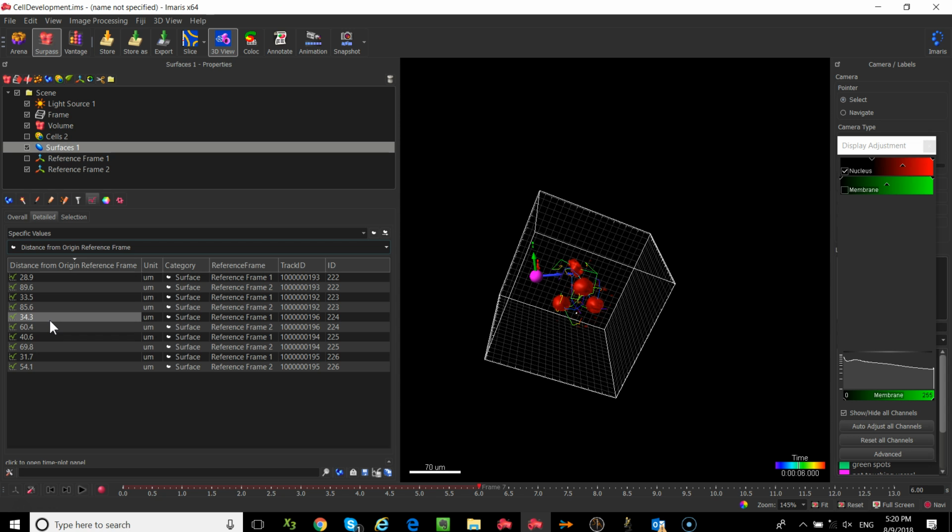So we just did a distance transform where we used another structure as a reference point. We made the DNA our reference point and created a distance map from that. A reference point allows you to place a new origin. So it's an alternative. If you have a point of interest or a plane of interest, it's an alternative to using a distance transformation. Okay?